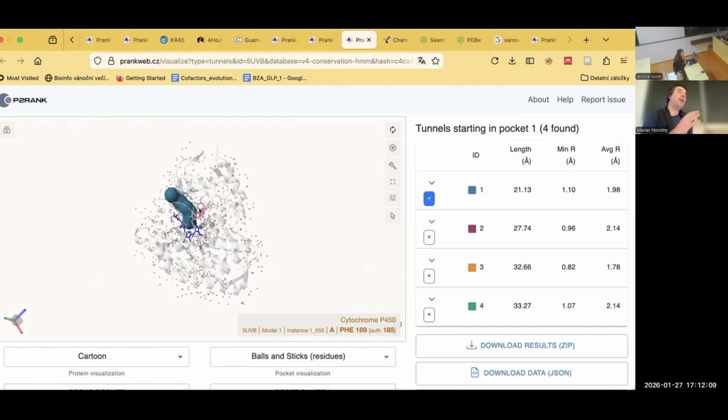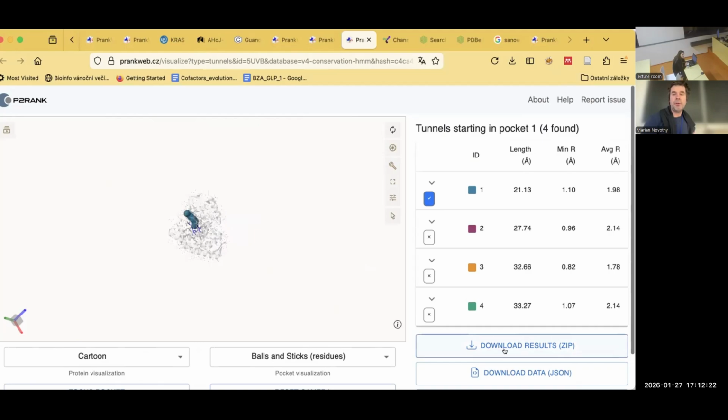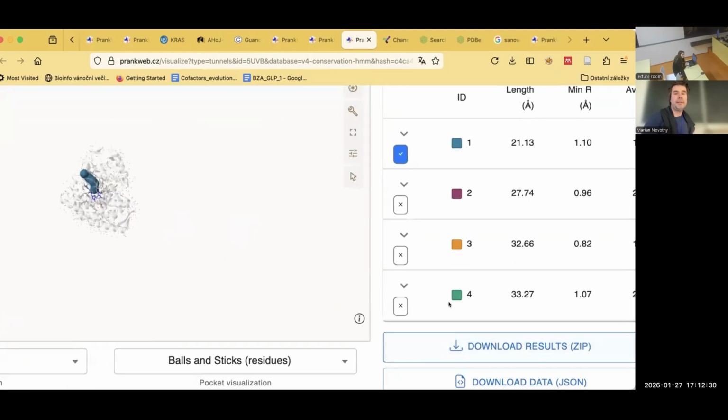So if you are not able to do that, and you would be one of the vast majority of the population of this planet, then you can use PyMOL or whatever you want. Whenever there is, you can download the results and see them in a more friendly program, which we are used to, right?